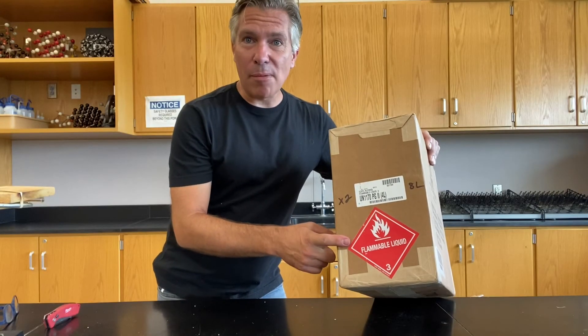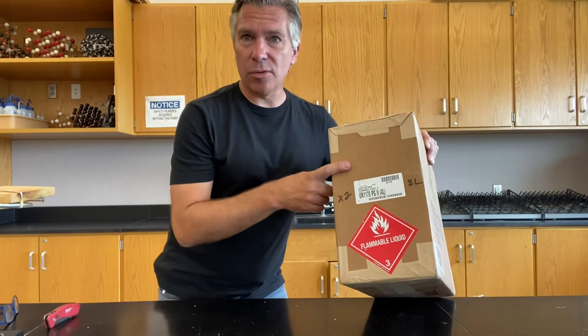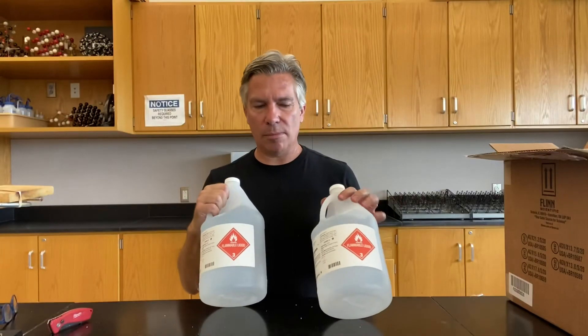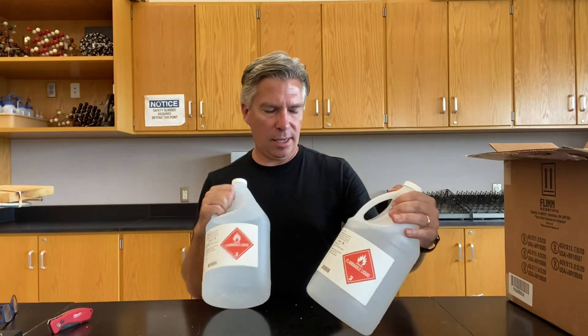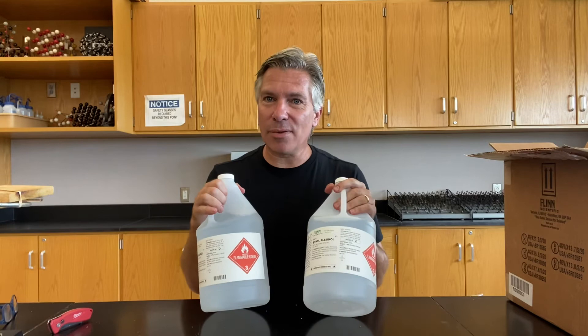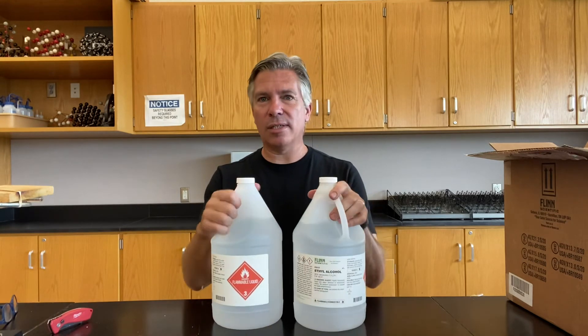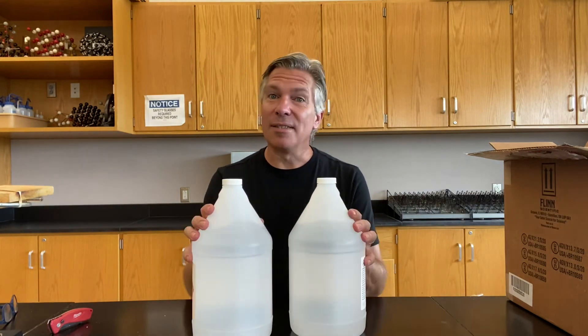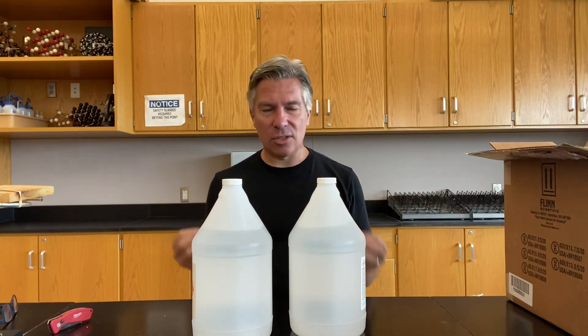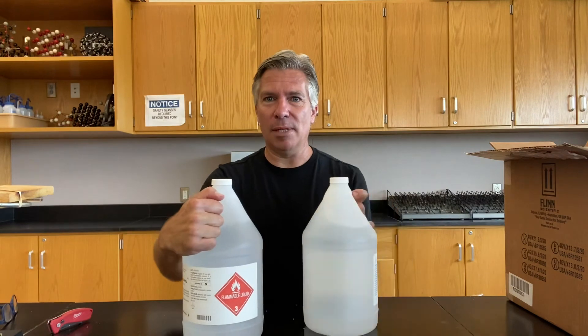This one only has a flammable sticker — not corrosive and flammable, just flammable. These two are both bottles of ethanol, otherwise known as ethyl alcohol. We have two bottles because we use this quite a bit — not for drinking, of course, but for burning, dissolving, and other really cool things you can do in the chem lab.